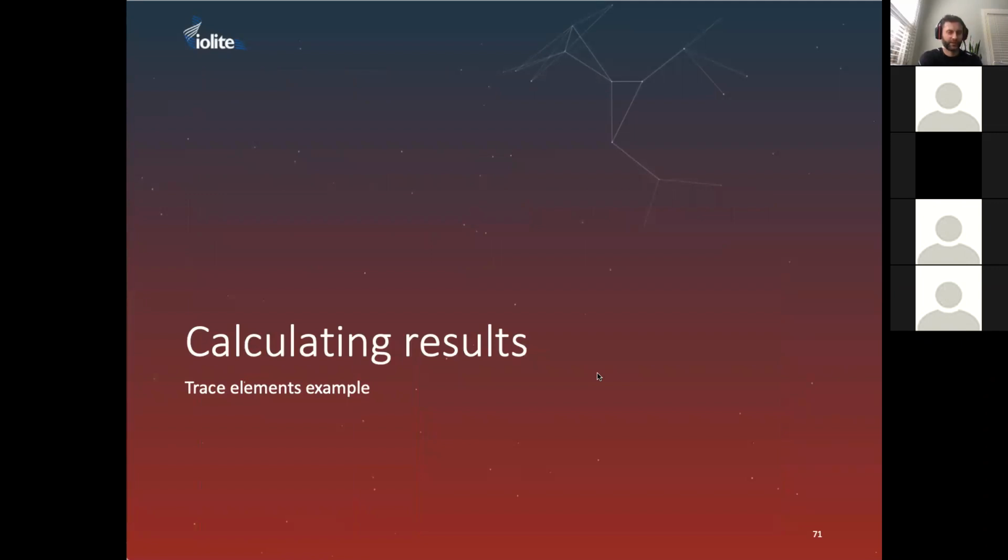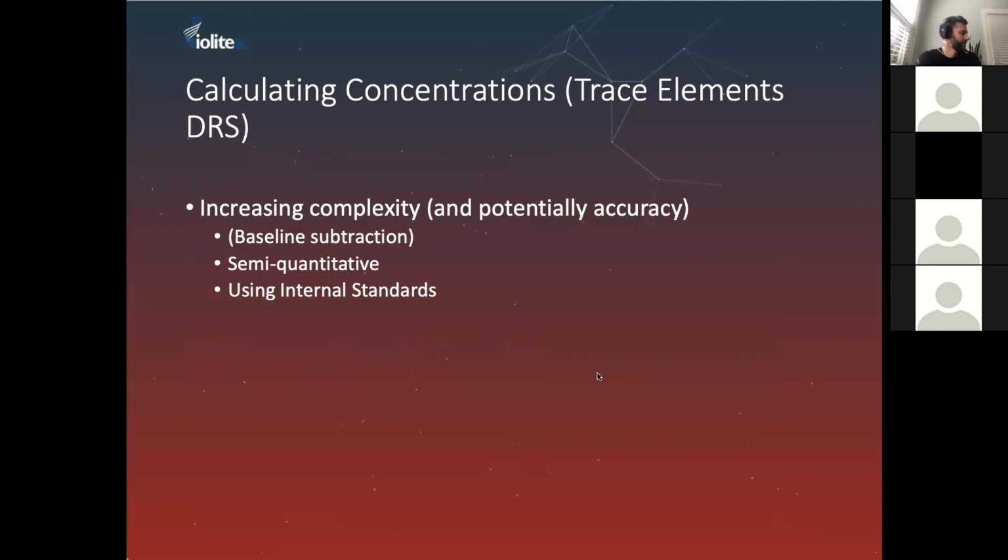And we'll be looking at trace elements as an example, but it's very similar for anything you want to do. And for those people who are doing imaging, you'd still do this part because you want to calculate your trace element results, but instead of just exporting some stats for each selection, you'd actually create an image at the end.